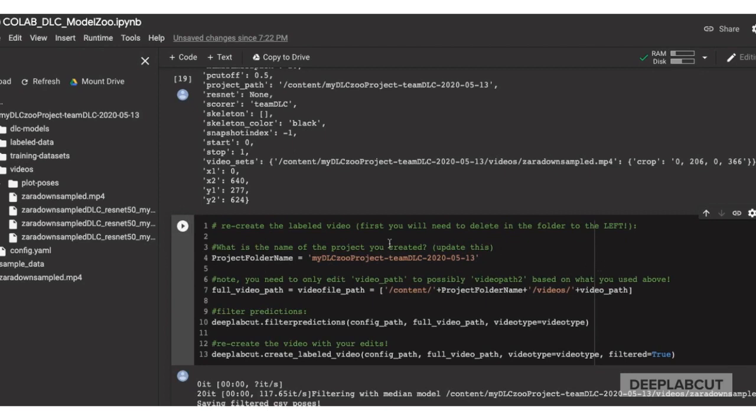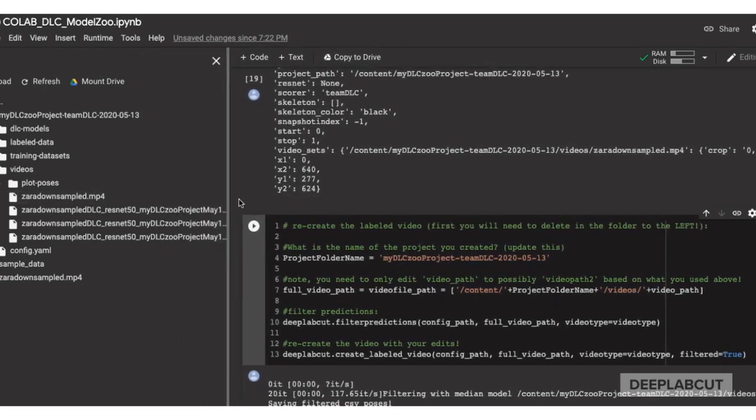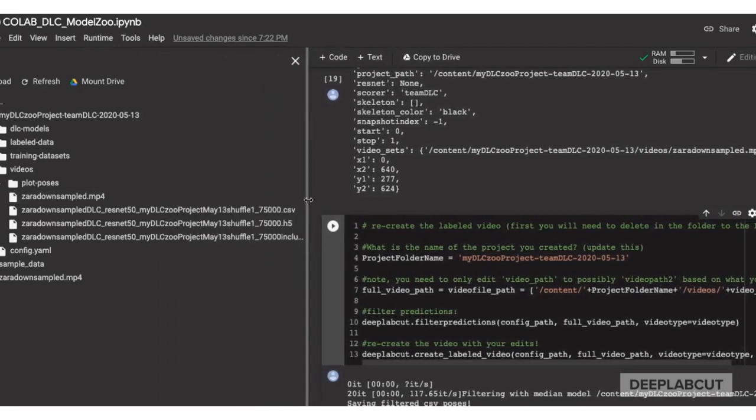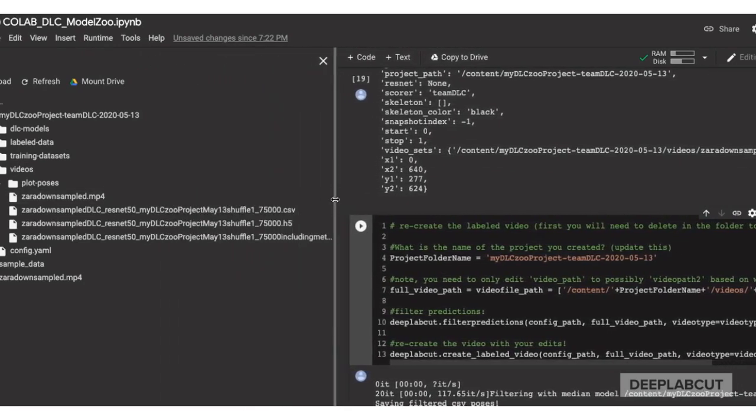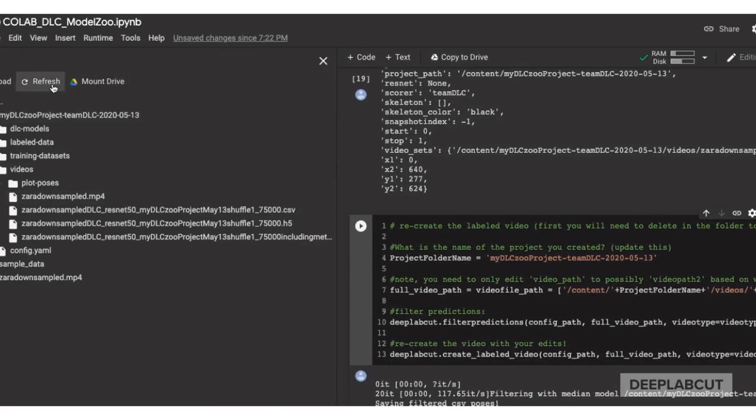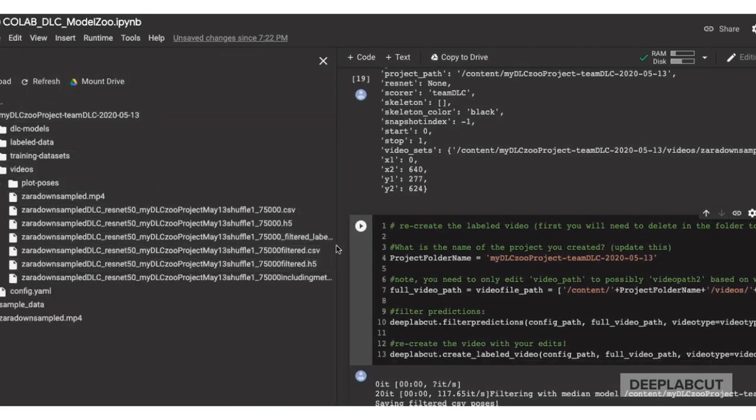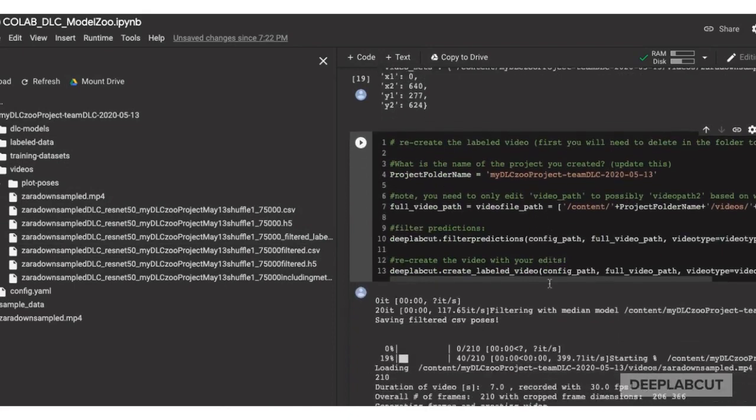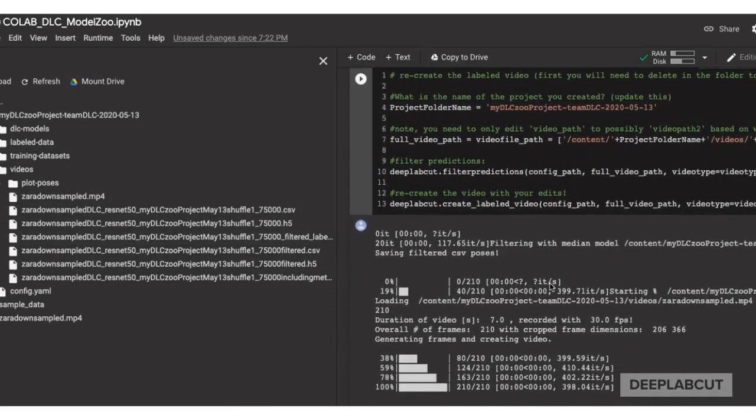Now you'll notice that you have two new files in H5 and a CSV with your filter predictions, which will be used to create the labeled video with the specified points, p cutoff, and color map that you set above.